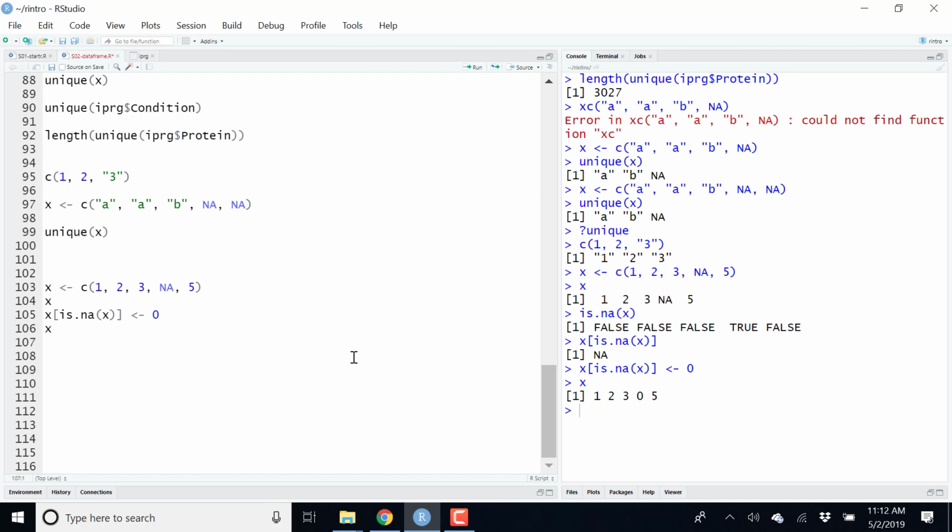If you do high throughput biology data analysis, you would typically not do these kinds of things by hand, because you would use dedicated tools that implement well-defined imputation methods. And one imputation method might be replacing by 0, but that is only valid in some circumstances. So you would want to use possibly more sophisticated tools first to see if imputation by 0, or left-censored imputation, that's a type of left-censored imputation, makes sense. But the R syntax would be something like this.